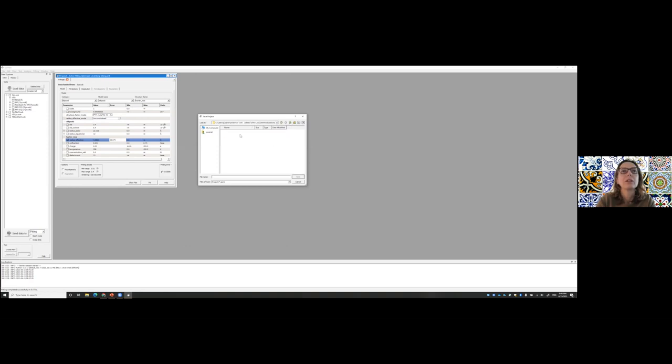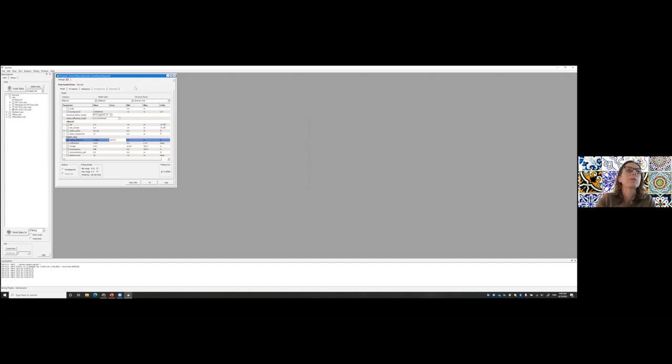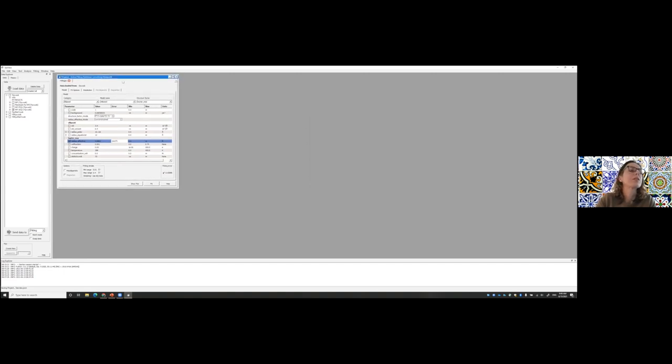I'm going to put it here. And then I'm going to save it to SASU, for example, so that if the program closed by mistake for any reason, you could open it again and you would not lose your fit parameters, okay? So then you'd move on to your next sample.